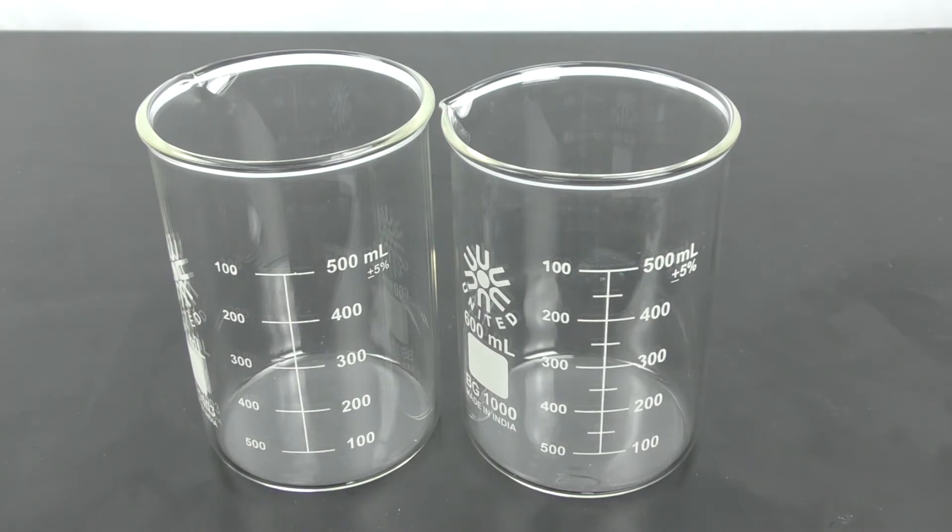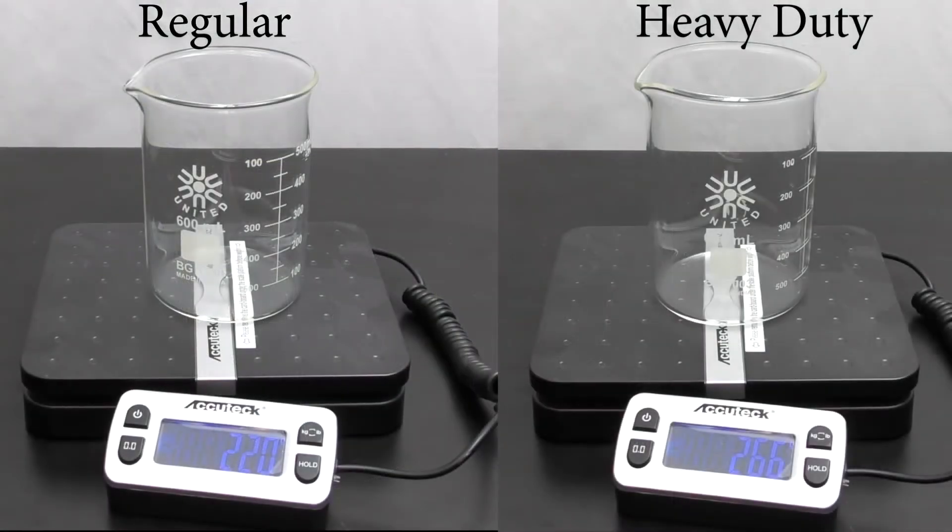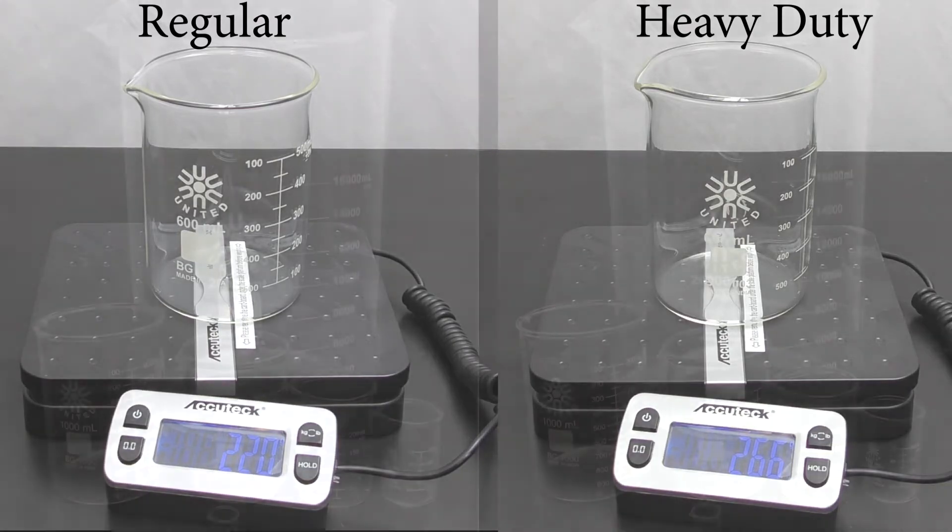As an example, here are the weights of two equal volume beakers where one is a heavy duty and one is a normal beaker.